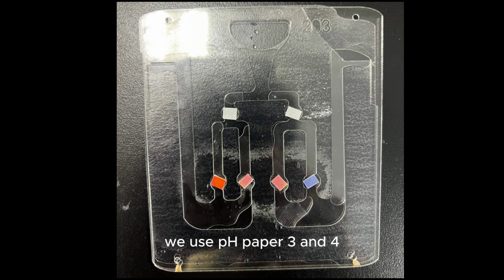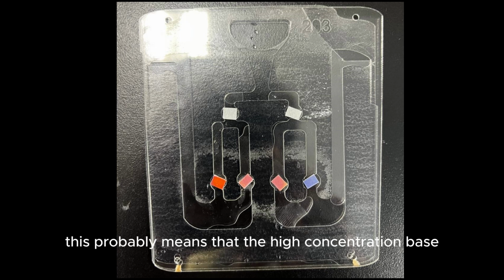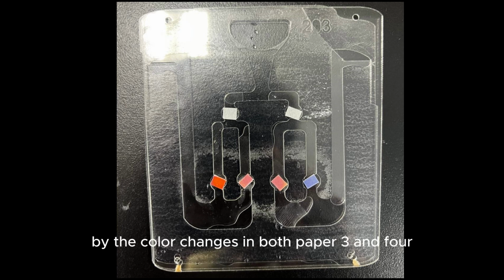On the right side, we used pH paper 3 and 4, which measure pH ranges 7 to 10 and 11 to 14 respectively. Both papers had changed color. This probably means that the high concentration base neutralized the low concentration acid to a pH level between 9 and 14 as indicated by the color changes in both paper 3 and 4.